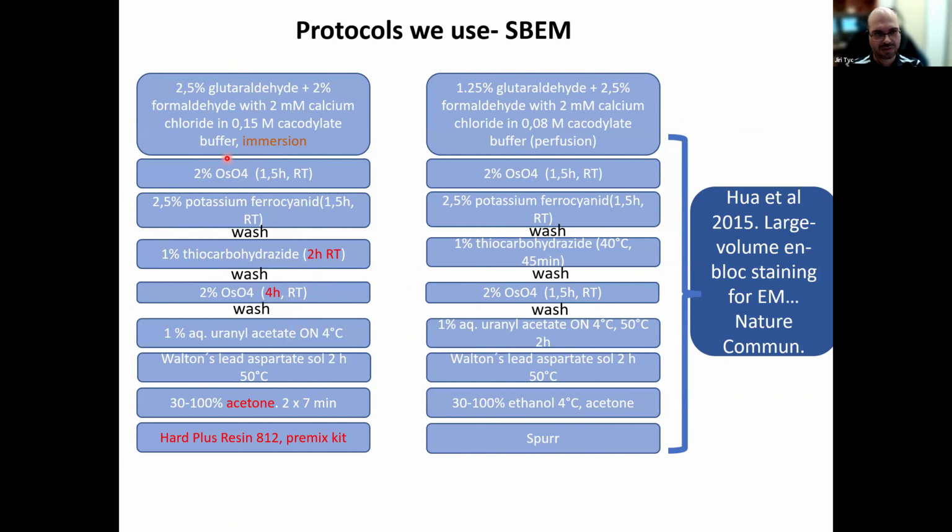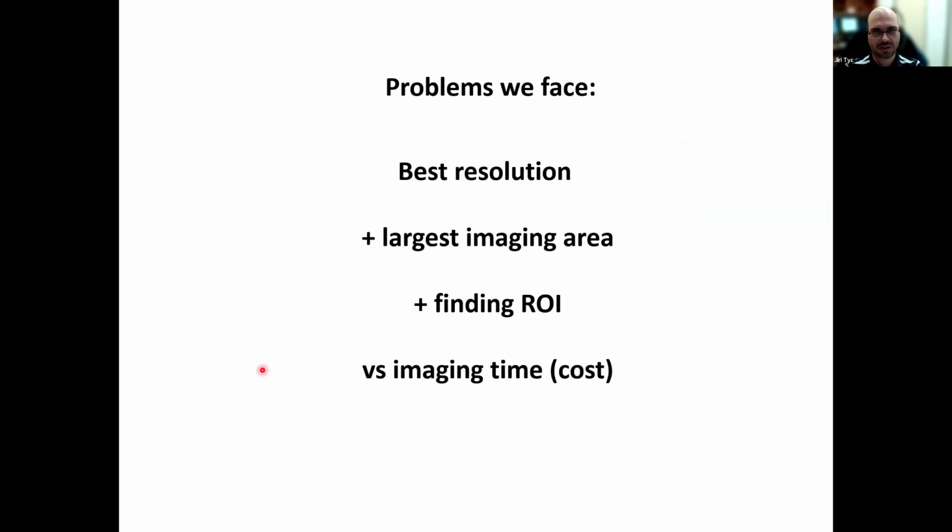So there, the transmission electron microscope protocol just works fine, just with the osmium and uranyl acetate and lead aspartate. So either you can do it in block, or we also do the post staining of the sections.